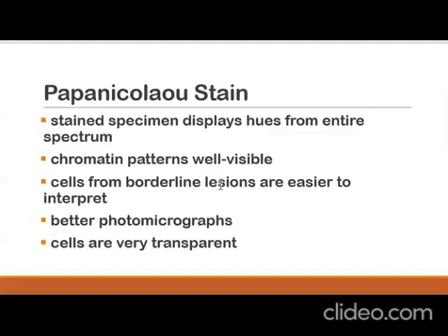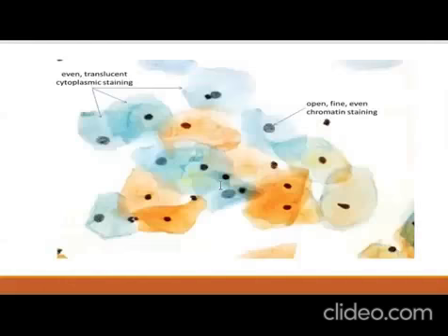Okay? So what do I mean by that? Let me show you a picture. So, this one. As you can see, cells here are overlapping, but even though they are overlapping, you can still differentiate one from each other. Okay? So that is the advantage of the Pap stain.